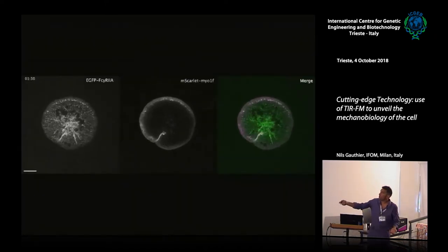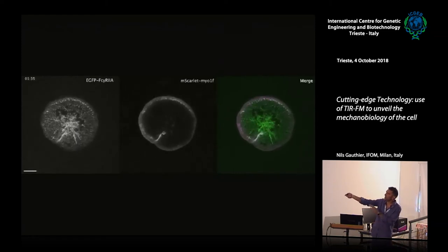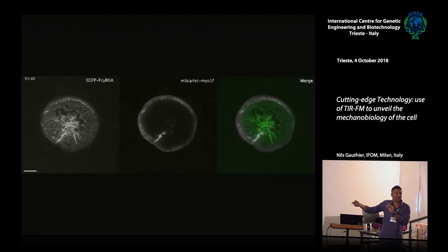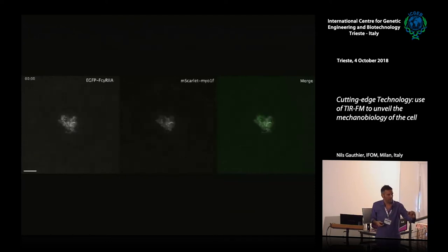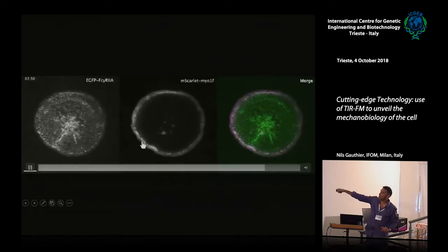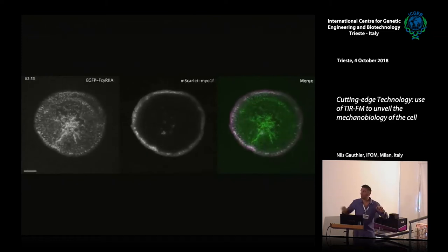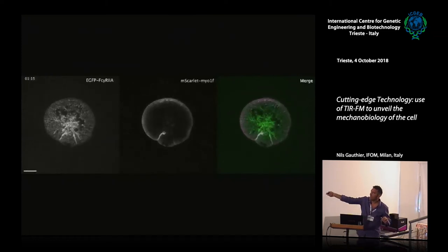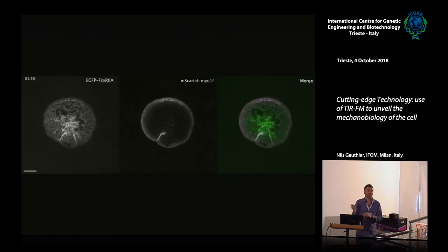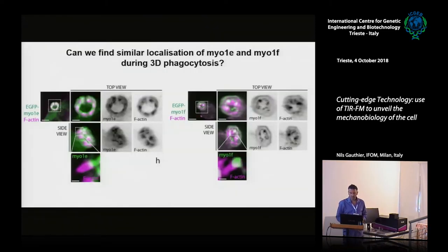Then you can do this by movie, adhesion here, Fc receptor, myosin 1, and you see it's not staining all the receptors at once, but it's staining all along the movie. If I fix at a given point, you see only myosin in some at the edge. But if you look at the entire movie, all the receptors that you have here on the substrate were at one point associated with myosin 1. Then this was a link between the receptor and the actin polymerization, and that's what we tried to find out.